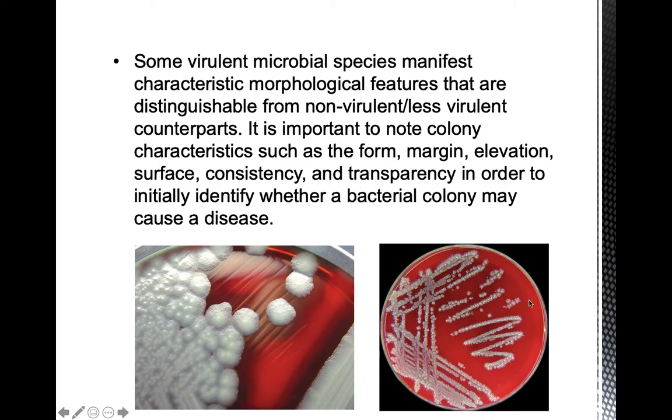On the other hand, this one is a different Bacillus species. This is Bacillus licheniformis, a less virulent type of Bacillus. So you see very obvious, very different characteristics. Now, we want to ensure that we have an idea of what we are working on.